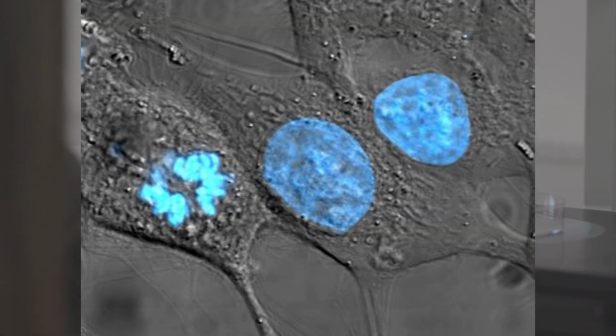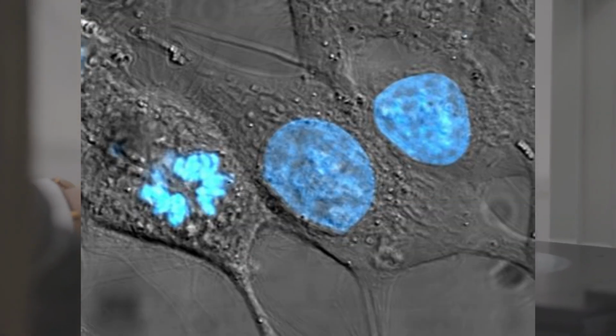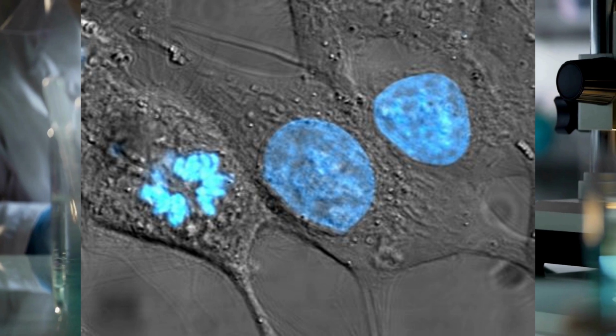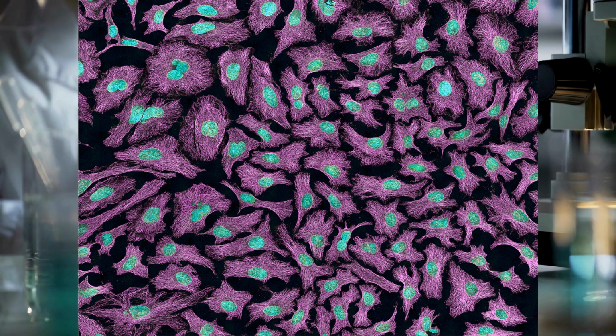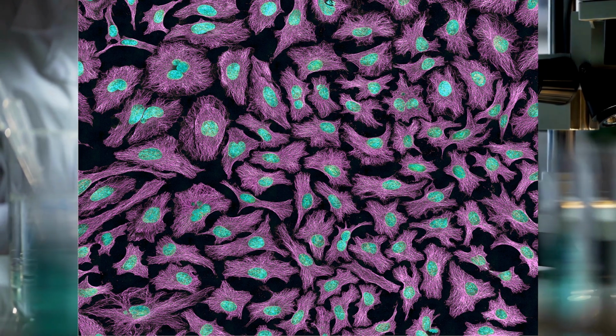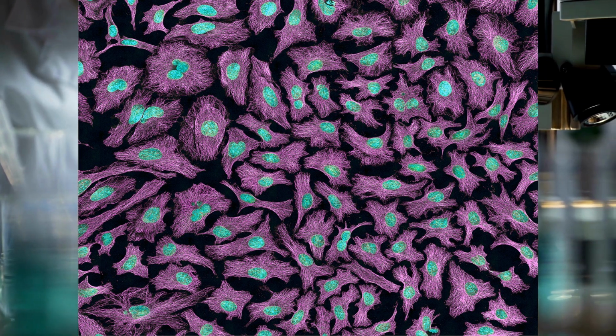So for instance, if you're looking at that nucleic acid staining method from earlier, you can tell where the DNA is, and you might be able to make it such that it also stains RNA. So now you have DNA and RNA stained, but you don't really know what it's doing necessarily.